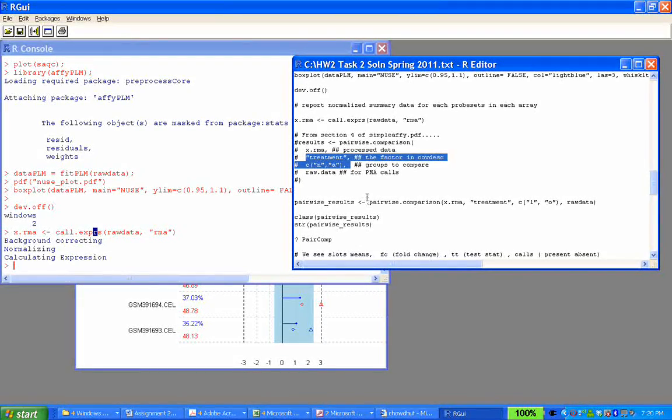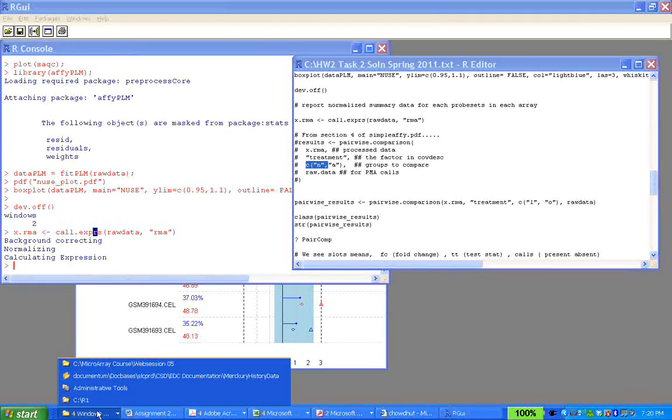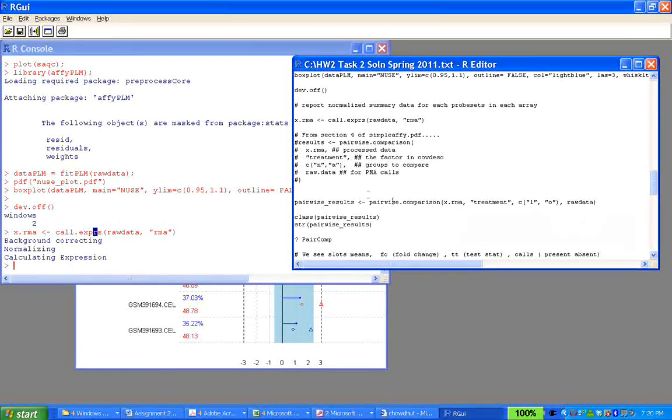That gives you the factor, meaning lean or obese. In this example it is N or A, but if you look at the conf.txt, it was L and O when I showed you that, right? So in my scenario, the collection of L and O, and also you give the raw data to get the present absent calls, and marginal.